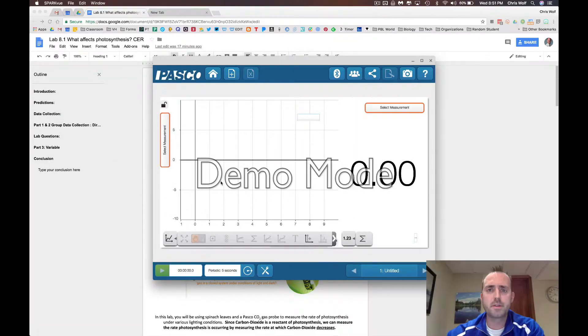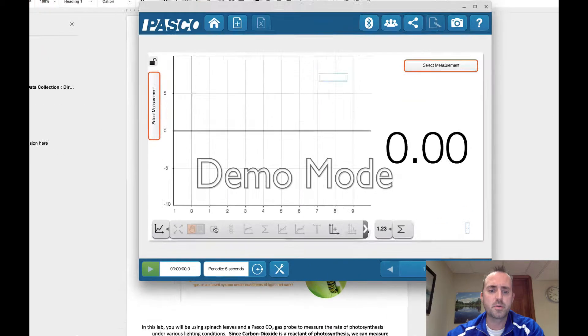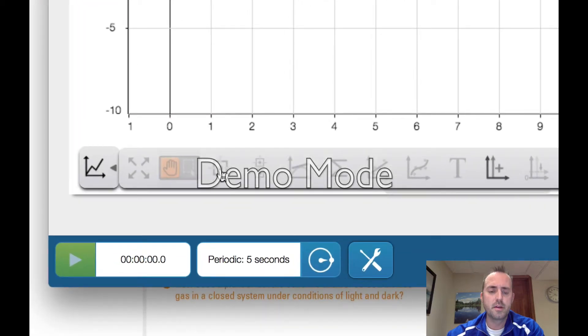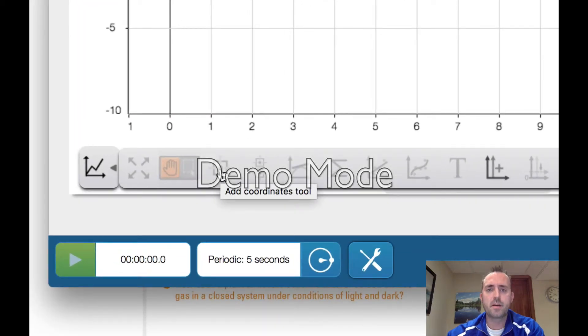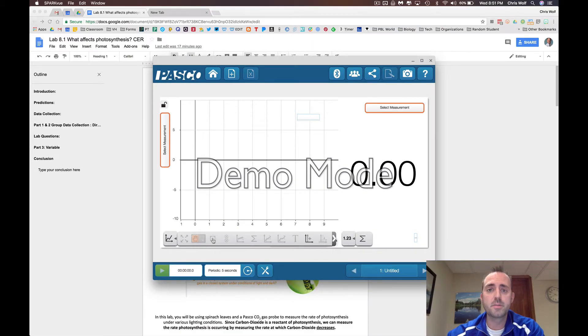Now after your 10 minutes are up, you'll see data on this graph. To read that data, you'll want to select this tool right here. This is called the coordinate tool. This will allow you to toggle up and down your graph to read data after every minute. This is what you'll be recording in your data table in your lab document.